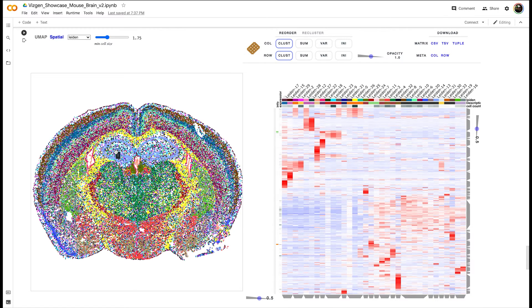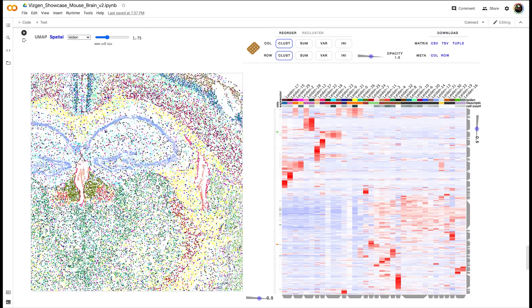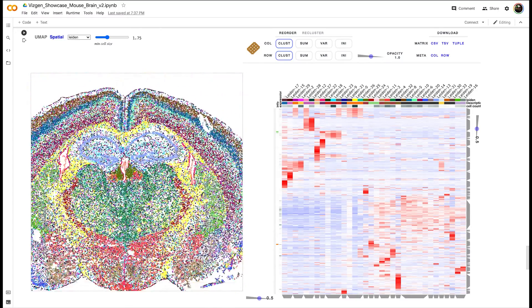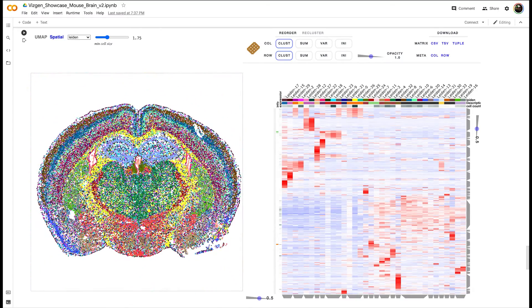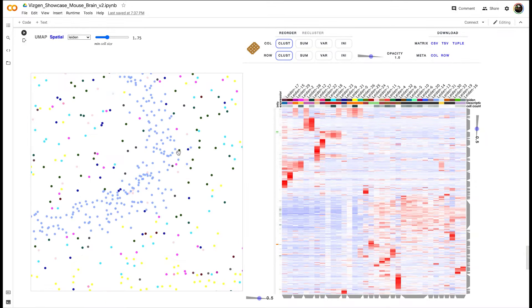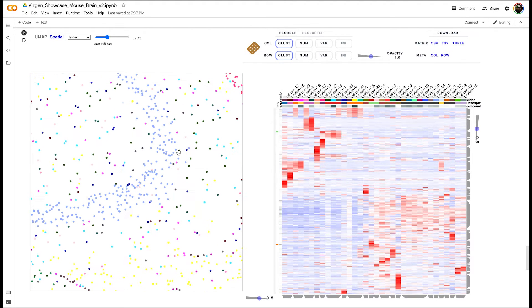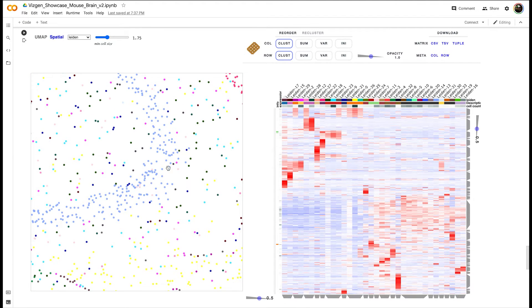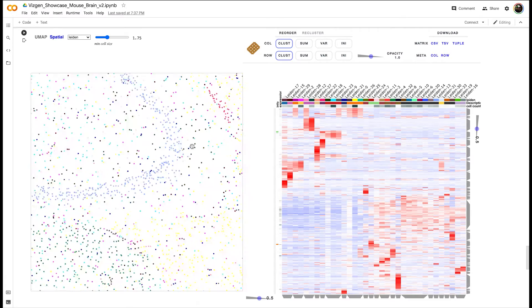On the left, every dot is an individual cell, and it's being colored by its Leiden cluster. You can zoom in and see exactly how cells from the same cluster are spatially located with respect to one another.